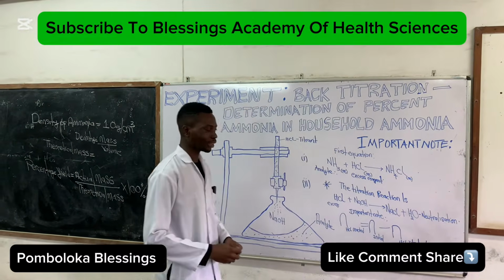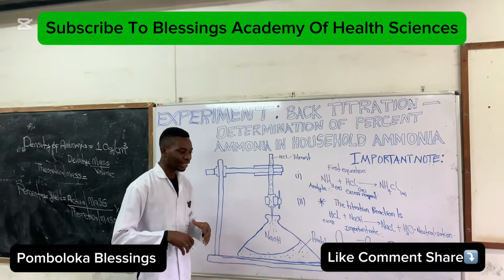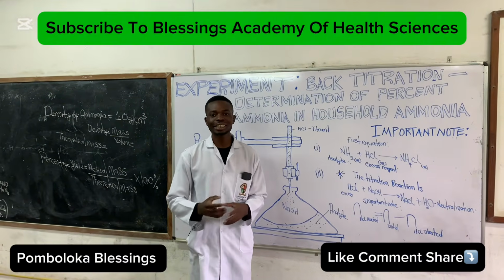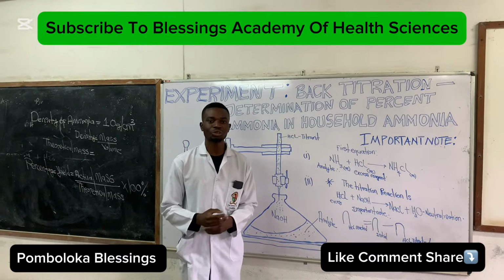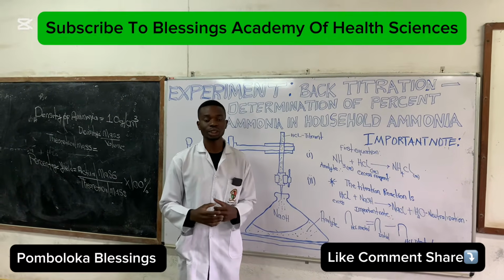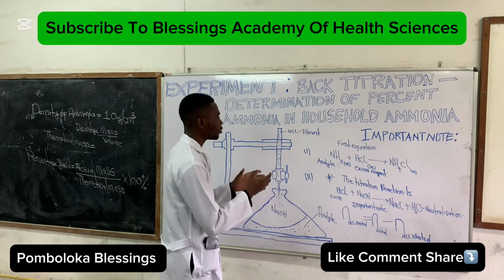Today we're trying to focus much more on back titration: determining the percentage of ammonia in household ammonia. In this important experiment, which is actually one of my favorites, it gets to explain exactly what we do during titration, and it gives us a major difference between normal titration and back titration. In back titration, much of what we're going to focus on here is the reactions that have been provided.